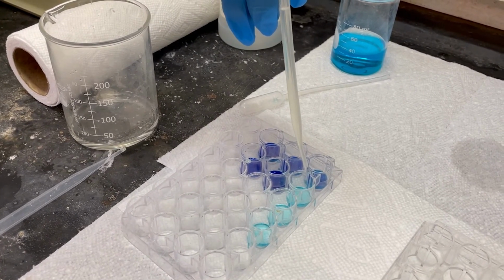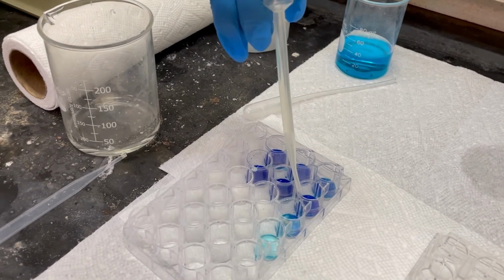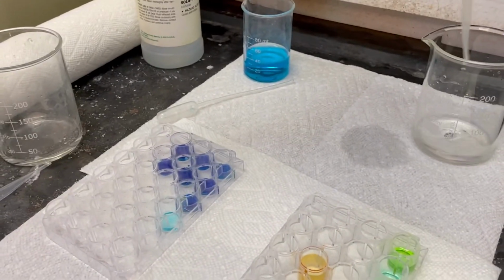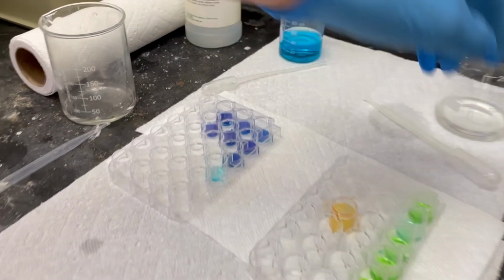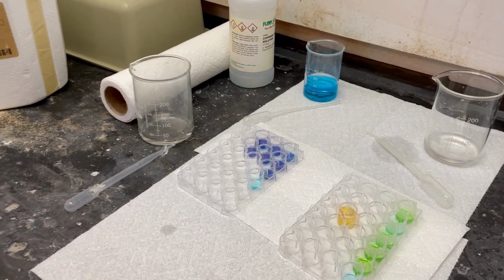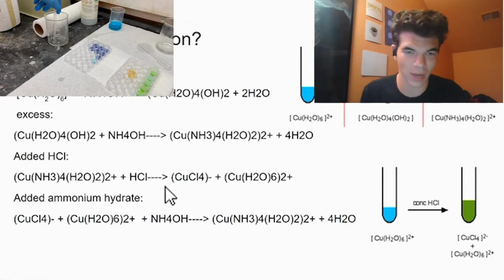Now that the reaction has been completed into the products, adding concentrated HCl in solution should change the complexes back into copper and water only complexes because the H+ ions in solution are what's needed as a product to shift the reaction backwards. This should make it a lighter blue again, but that's not what happened.